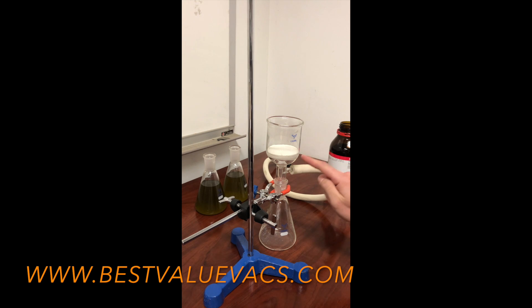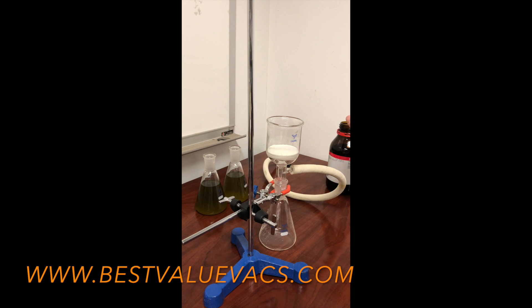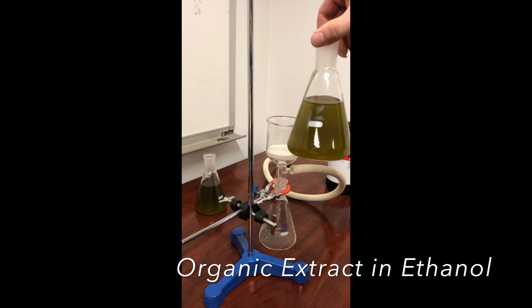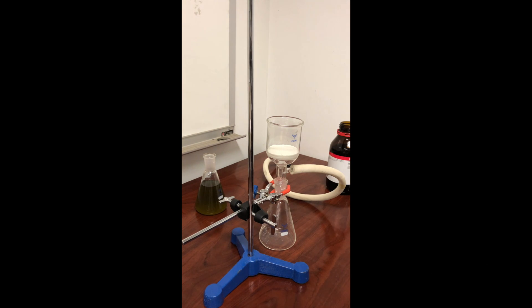I have a filter pad right here that's all dried out — in the previous video we made one as you can see. So we have a dried filter pad here with the Cellite 545, and I'm just going to demonstrate what it can do. I'm going to filter a solution so you can get an idea of how clean it can actually be.